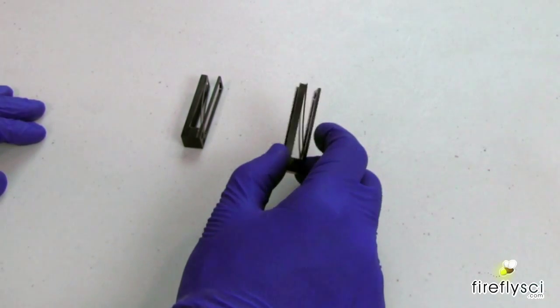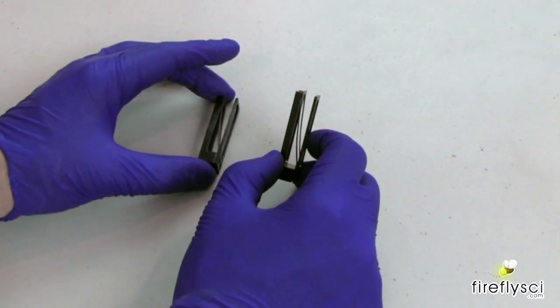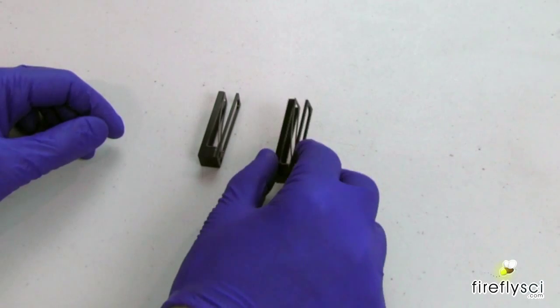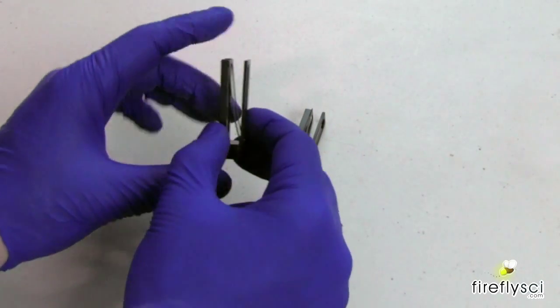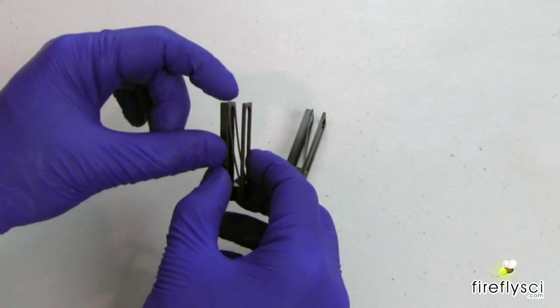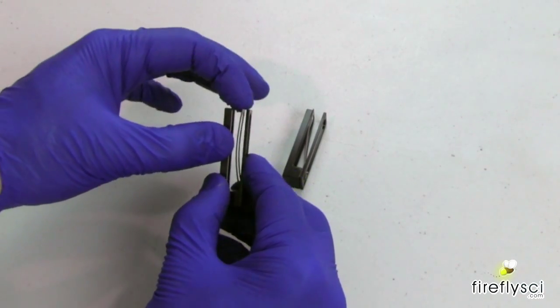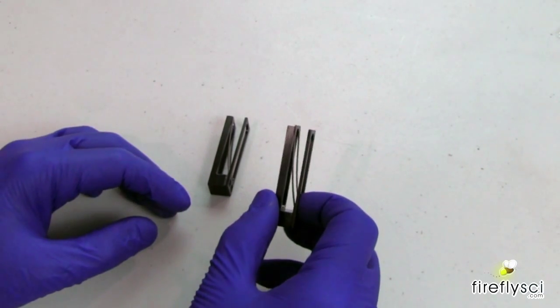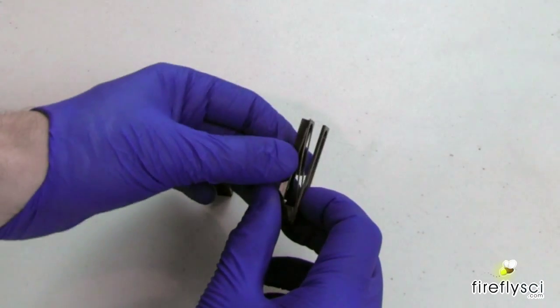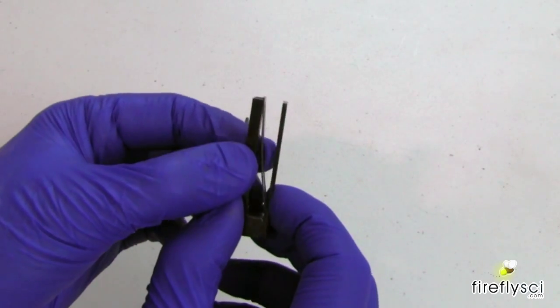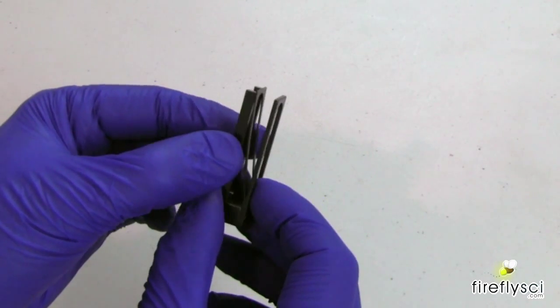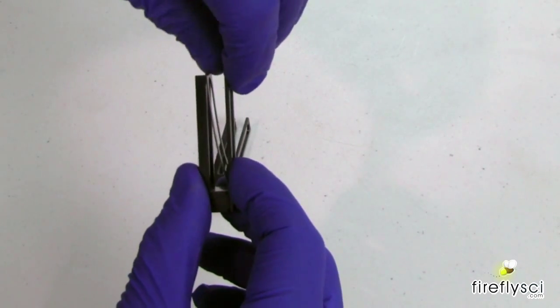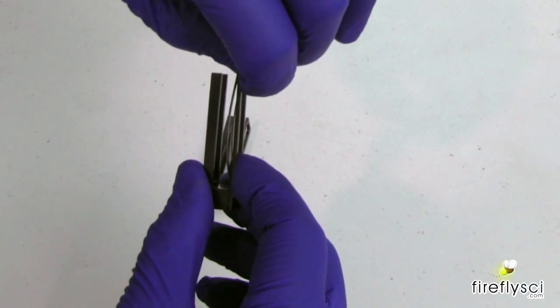First we're going to start with our A20 cell mounts. So I have both here, the A20 standard and the A20 ES. Now the difference between these two is the standard A20 has the spring here flat against the top. It's the spring you pull back right here and the A20 ES, the ES stands for extended spring. So this spring is a little bit above the top. So it's easier to grab when you're grabbing the top, it's much easier to pull back.